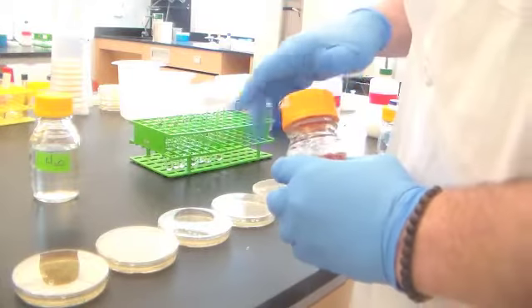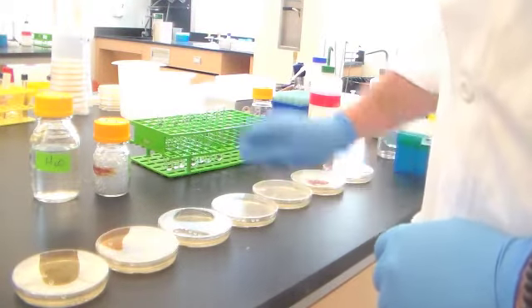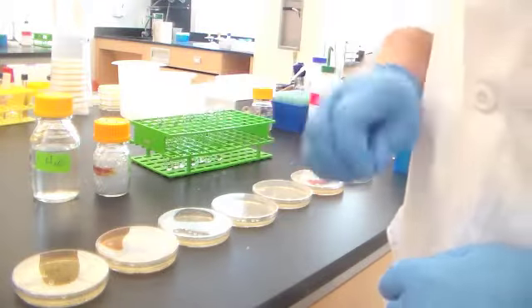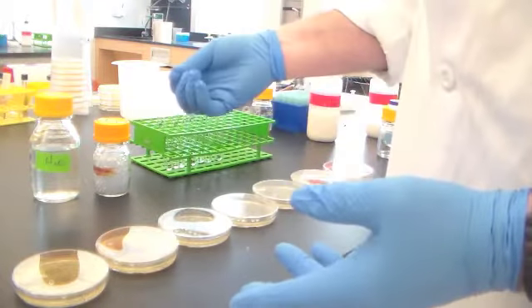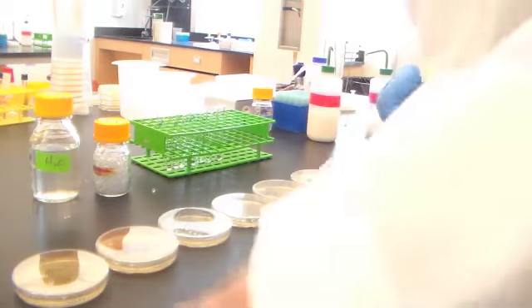I'm going to cap this back up. Now, there's a temptation to want to pick these up and put them back in there. They're not sterile any longer. So we're going to recycle these. We're going to use them again. So I'm just going to set them aside and hope they don't roll too far away.